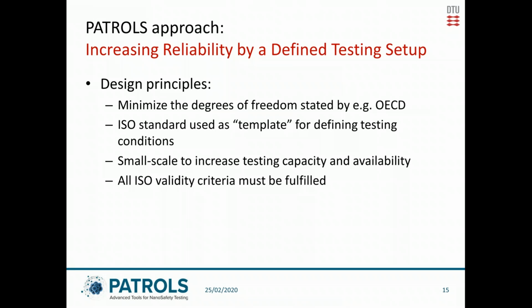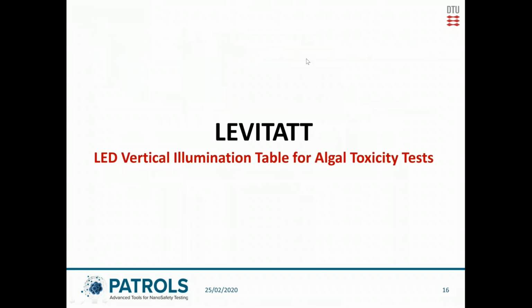We think we need to have samples enough to document that the ISO validity criteria are also in place. So these things have led to our development of the LEVITATT testing platform that I will now hand over to Lars, and he will give you an introduction to that.